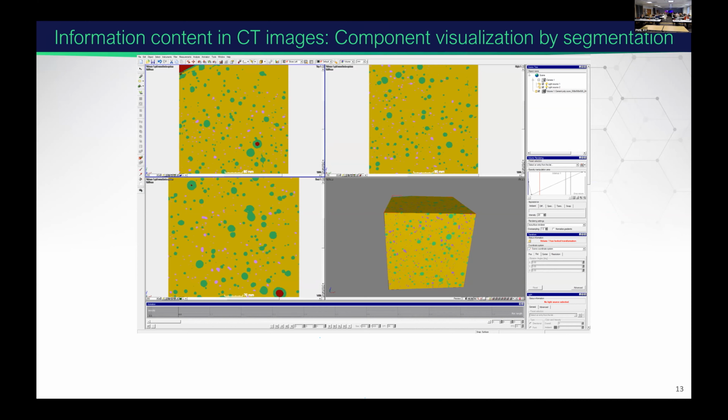I wanted to show you an example of an application of segmentation. This is segmented data of a 4-component system. And I want to bring your attention to this histogram, which is typically more like a bell-shaped curve going from low density to high density. If you have peaks in it, then you have a better contrast, separation of the components. In this segmentation, each density will be just represented by a line. The lowest density would be the pores in this case, and we segmented the pores.